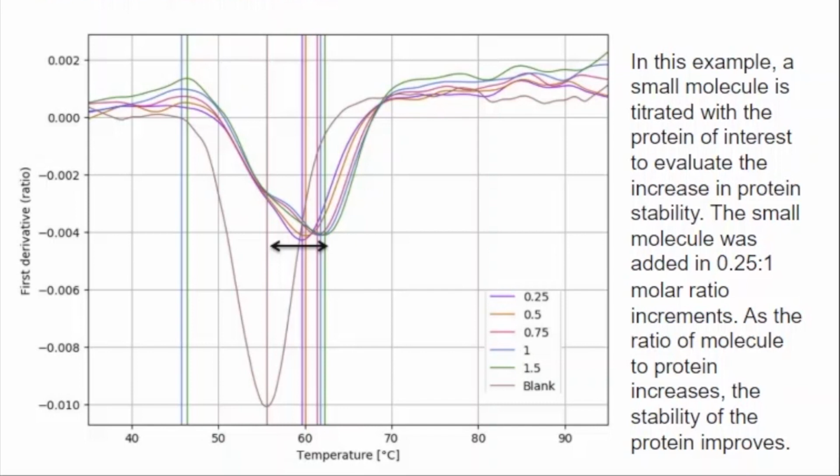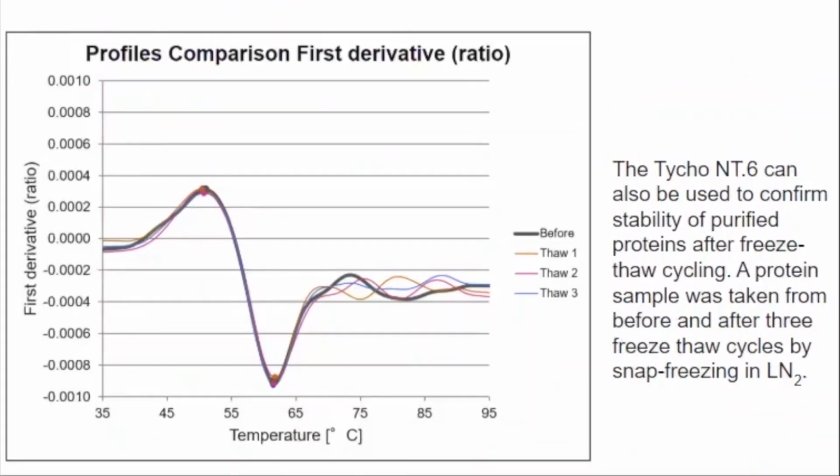Once we make those proteins, sometimes we're asked to send them to our clients for either activity assays or just to have for whatever other experiments they want to do. I just make the protein and send it along. And before we send it, we like to freeze our proteins in liquid nitrogen so that they can be preserved while they're shipped.